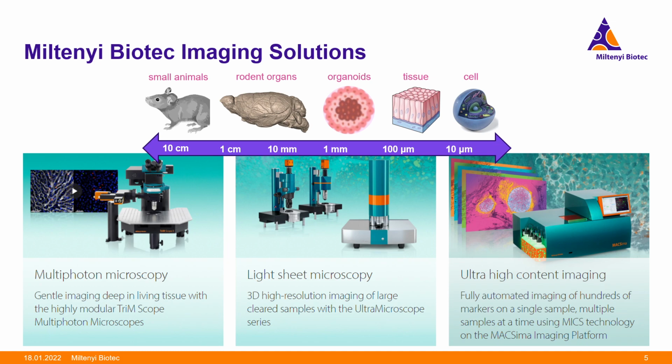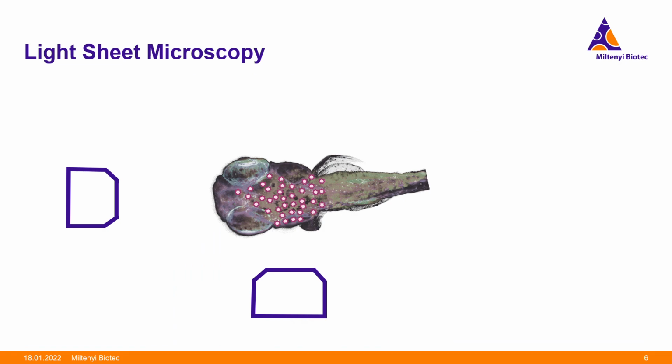So let's jump right in with the light sheet microscope that is focused on high-resolution 3D imaging. While many of you already have experience with light sheet microscopy, I'll just briefly touch on the technology. Let's take this zebrafish containing fluorescent molecules as an example.